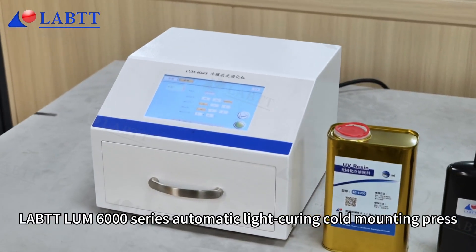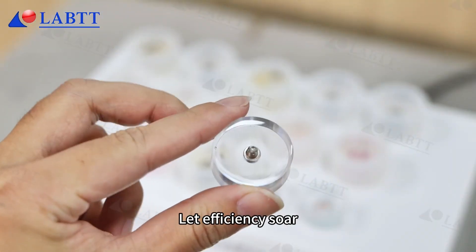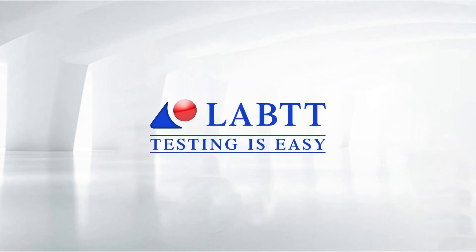LABTTT LAM6000 Series Automatic Light Curing Cold Mounting Press. Let efficiency soar. LABTTT — testing is easy.